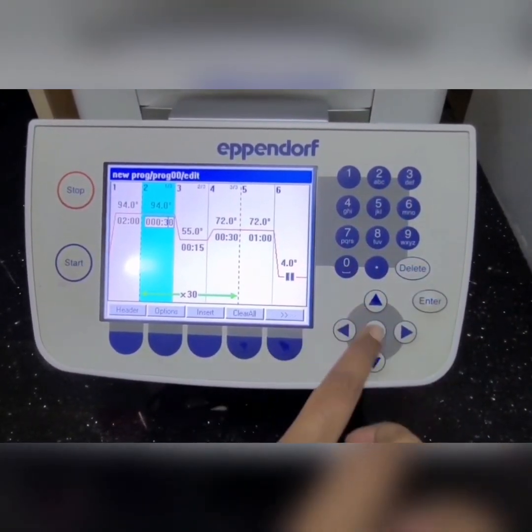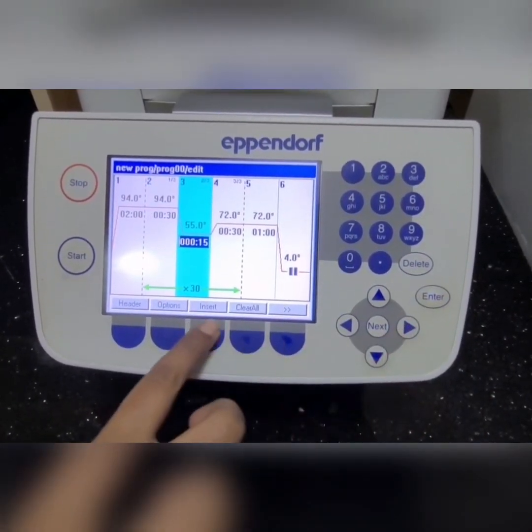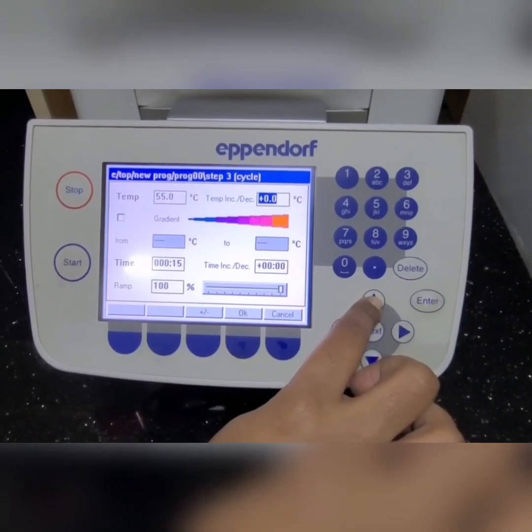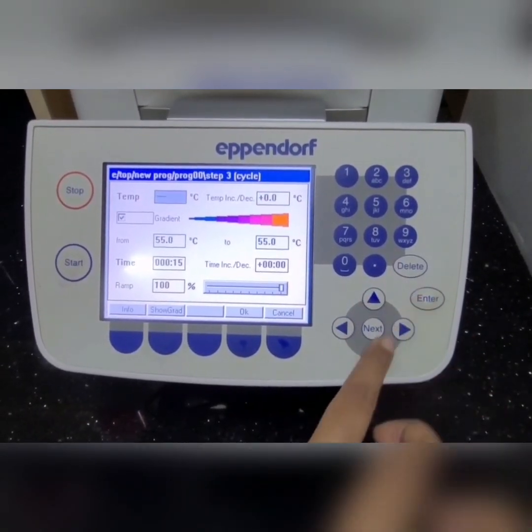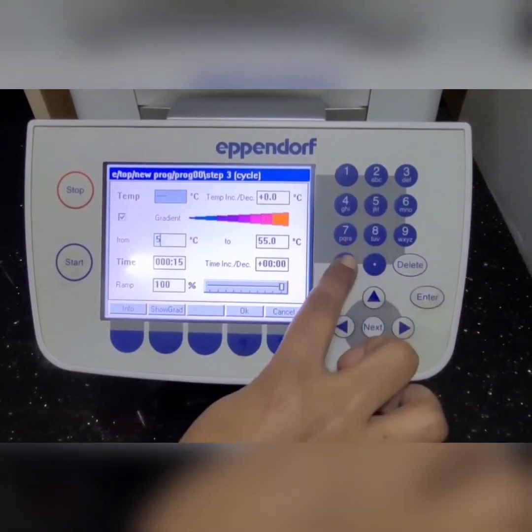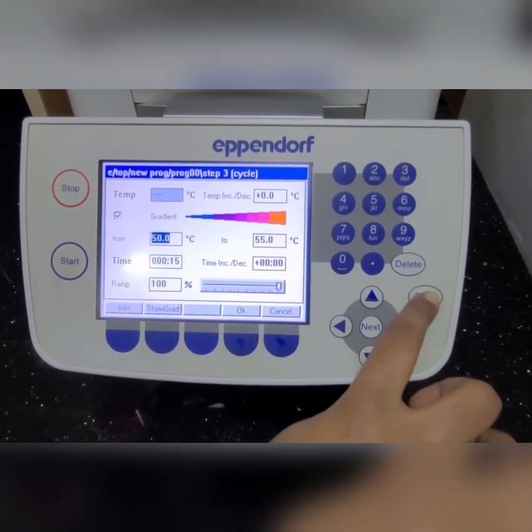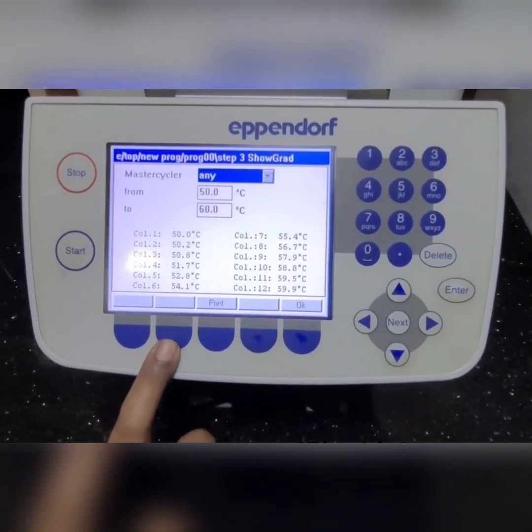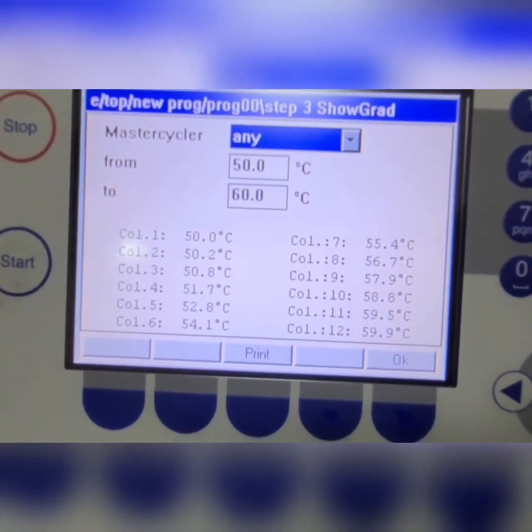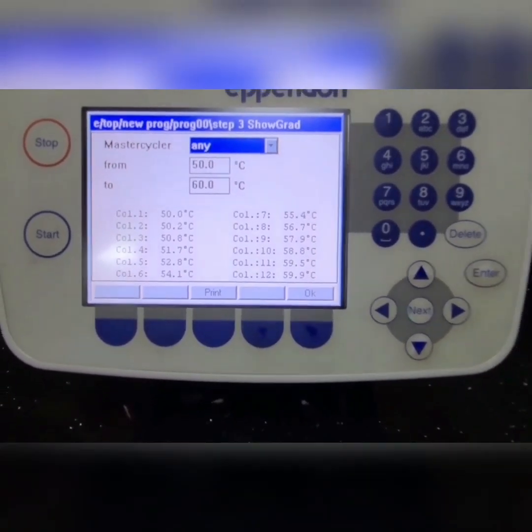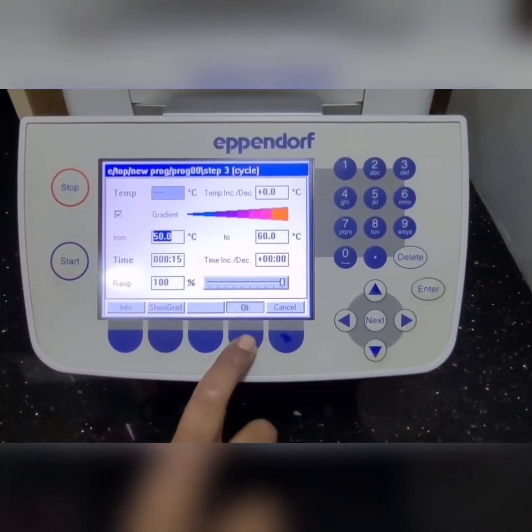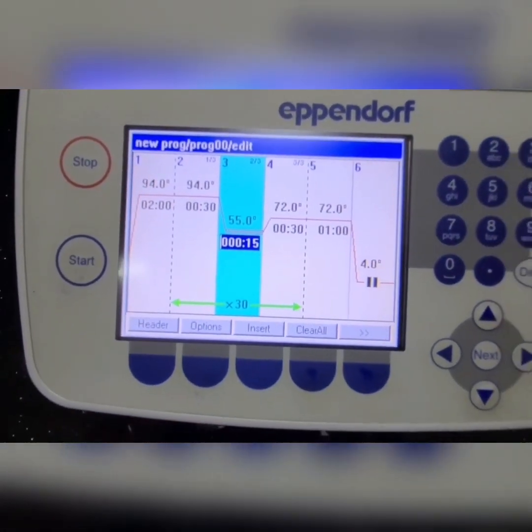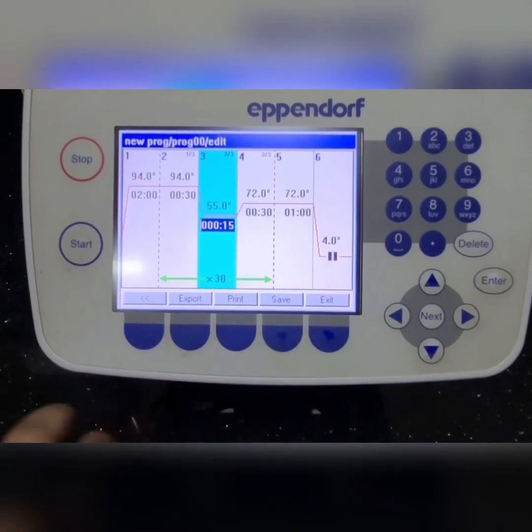Generally we set different annealing temperatures in gradient mode. Go to the annealing temperature and press Options — you will get a range of temperatures you can set, for example from 50 to 60 degrees. Then press 'Show Grid'; when you press Show Grid it will display the 12 columns of the 96-well block, each column showing a different temperature. You can choose whichever temperature column you want to place your tube in, then save the program and start it.